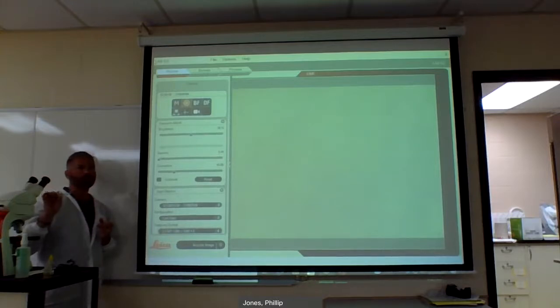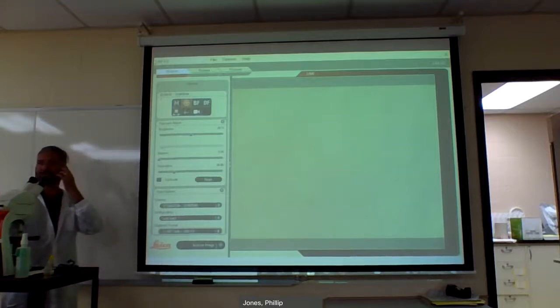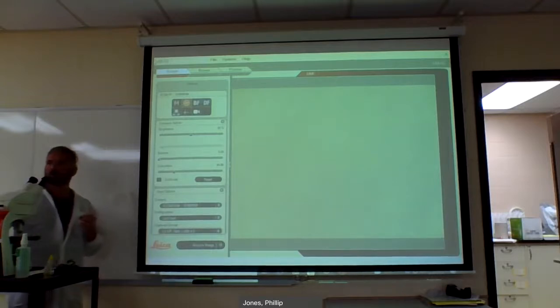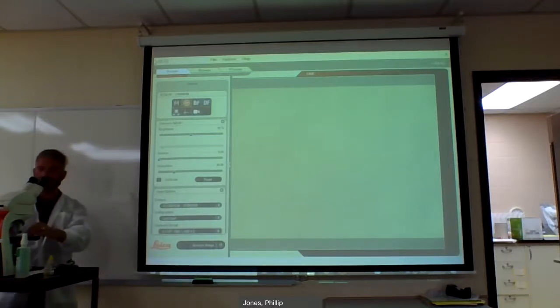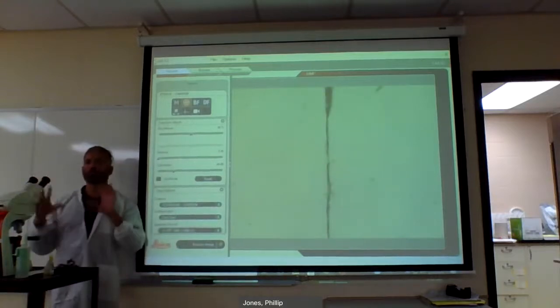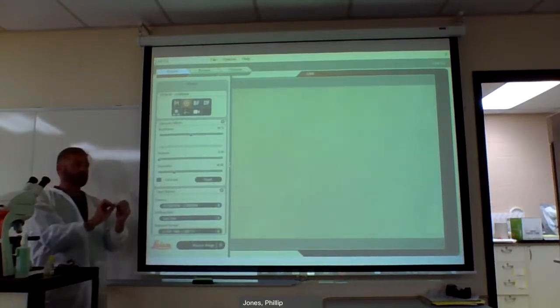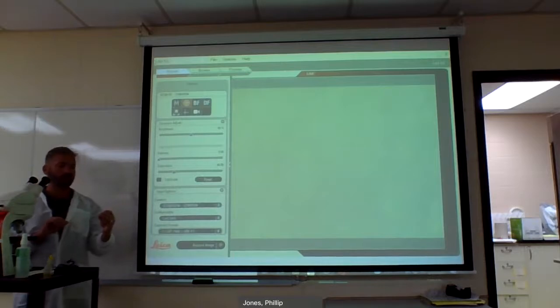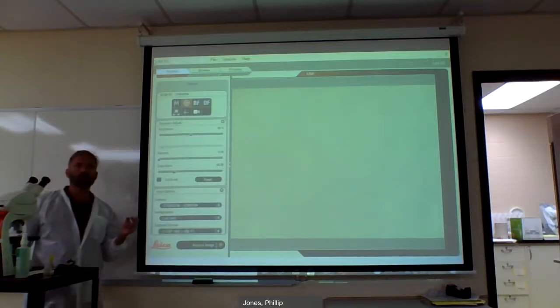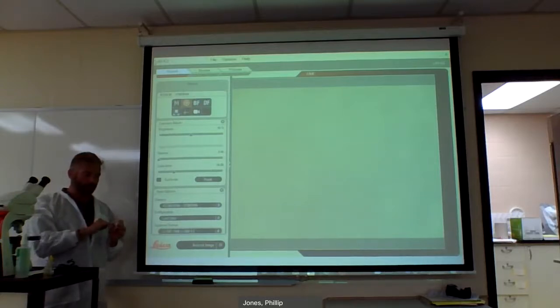You guys want to grab slides? Why don't we all grab one. I'll show you first, then I want to walk around. I put the slide in. This is mammal ciliated columnar — we have the cellular part. This is ciliated columnar.